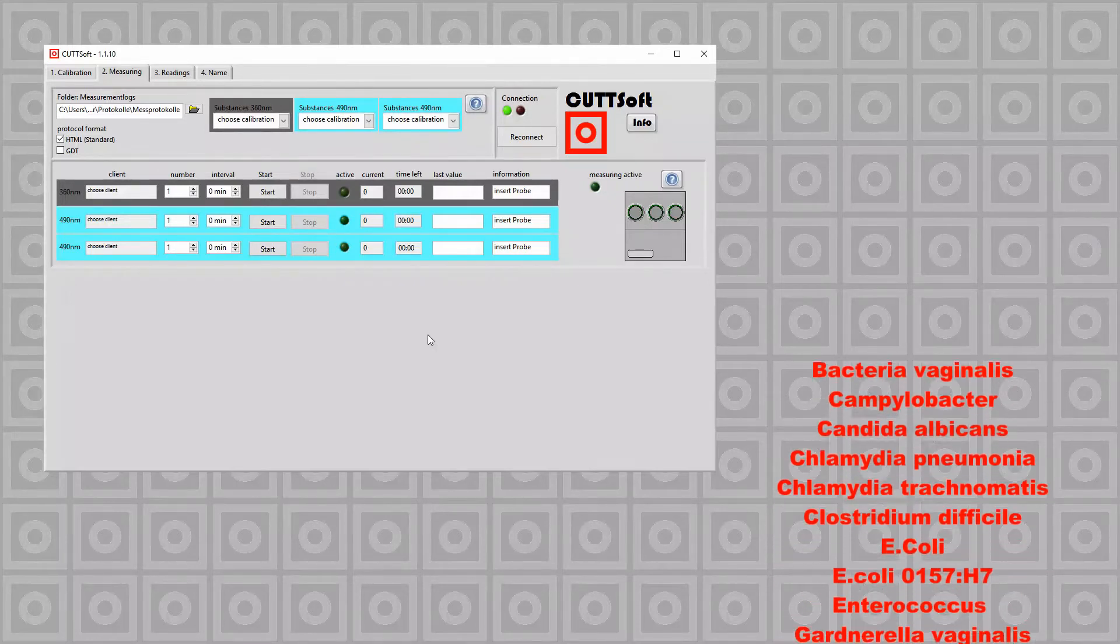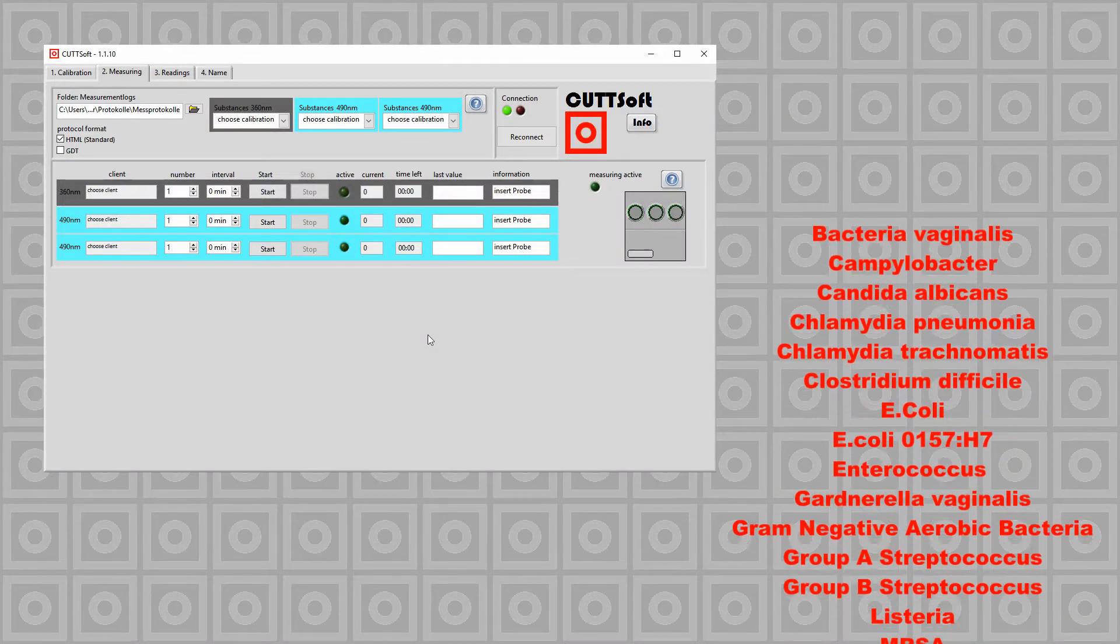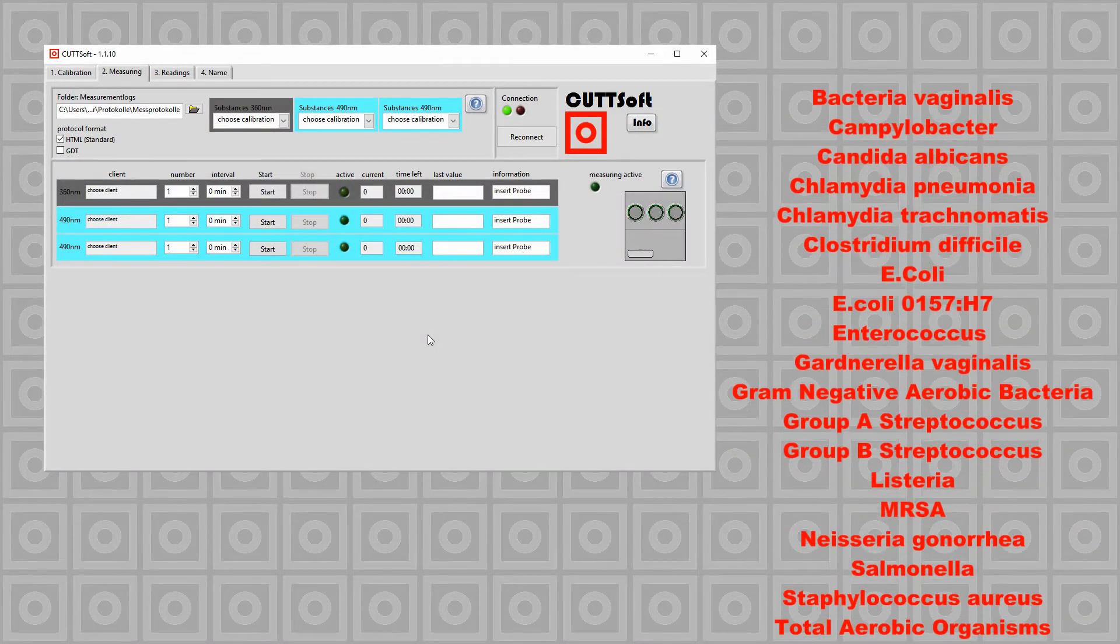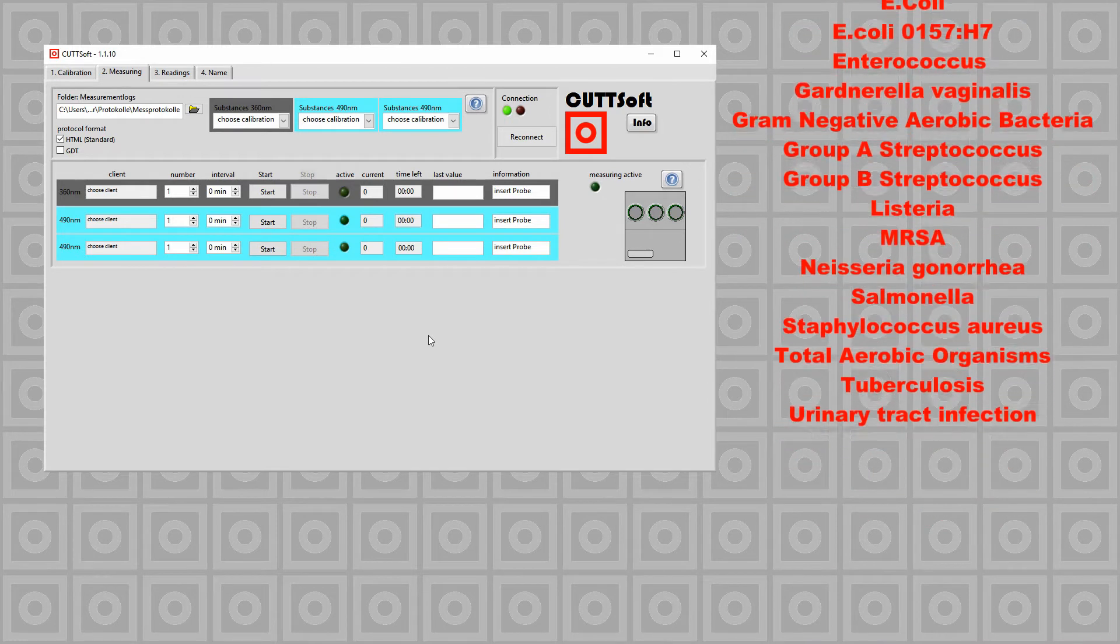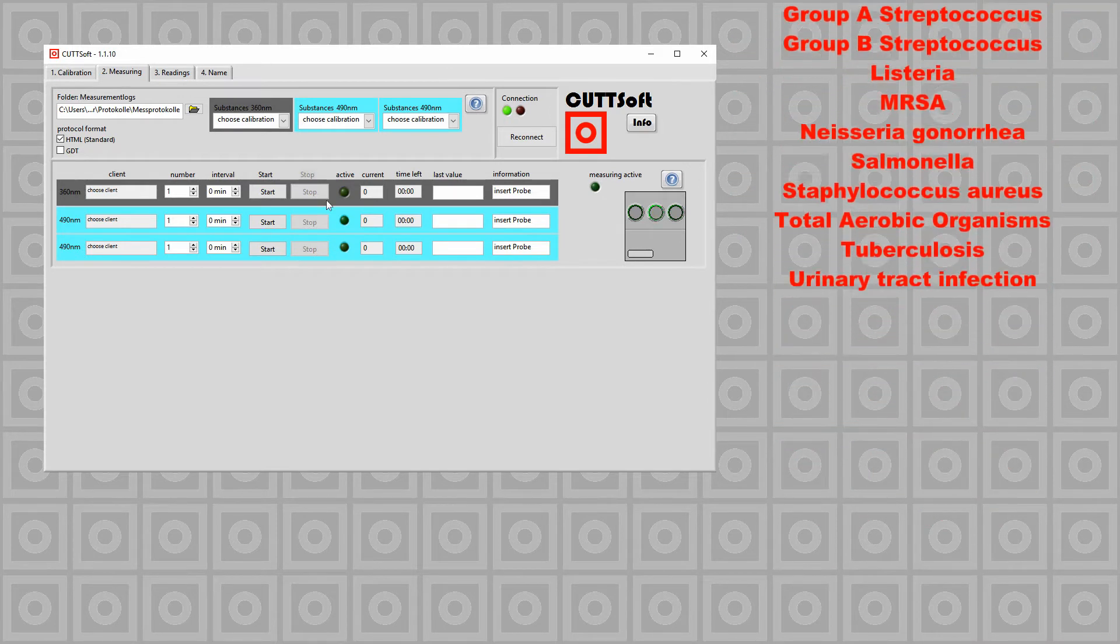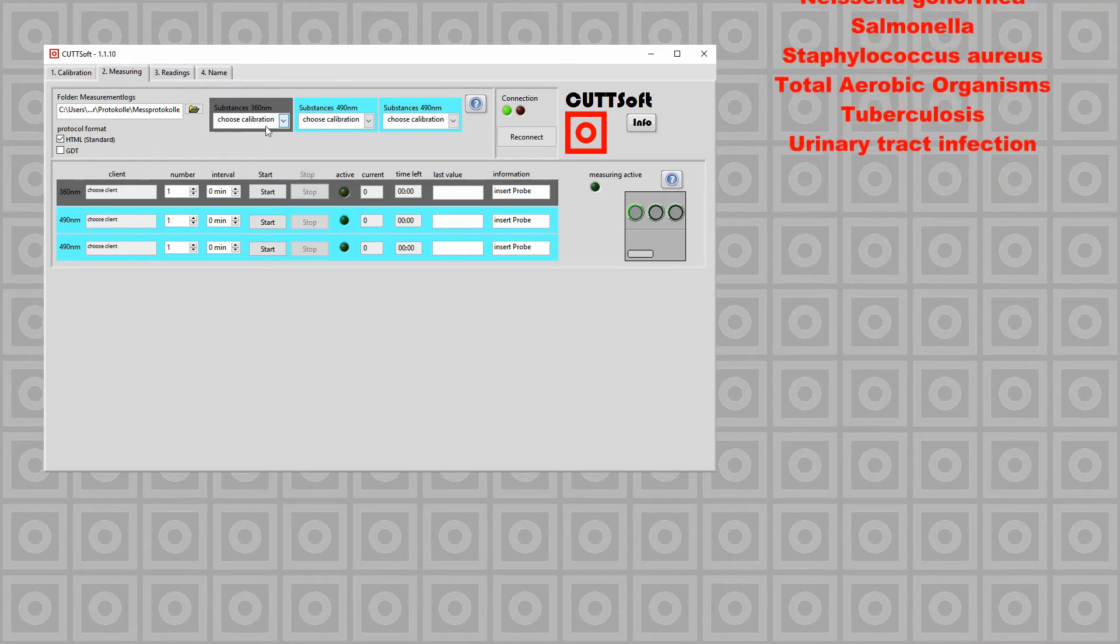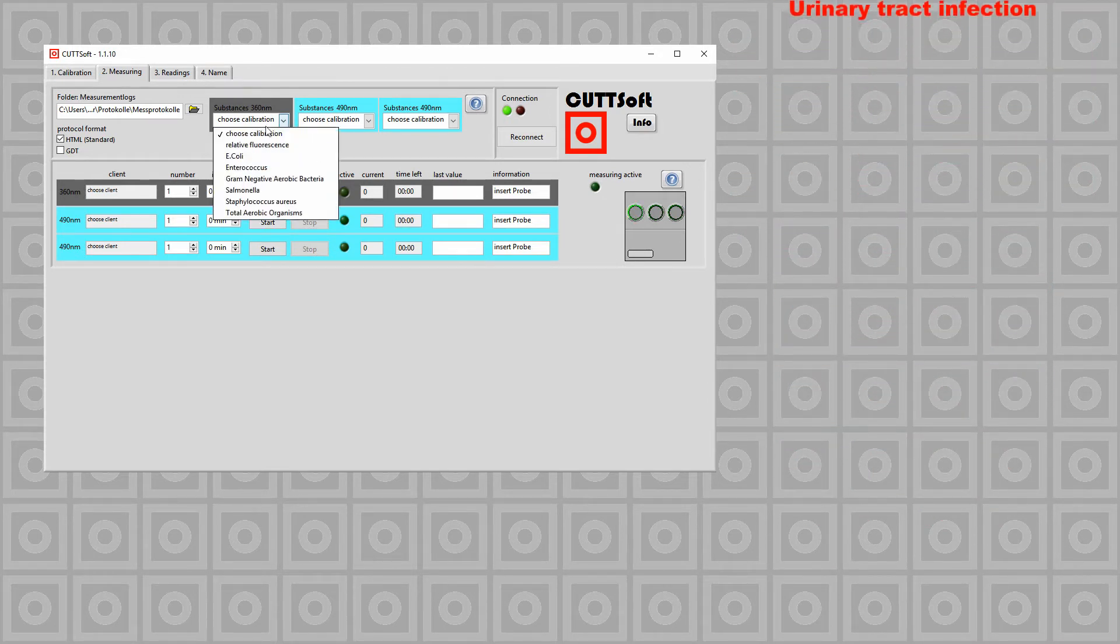This video demonstrates how a substance is measured using CutSoft. For this example we choose the 360 nm channel and the calibration for E. coli.